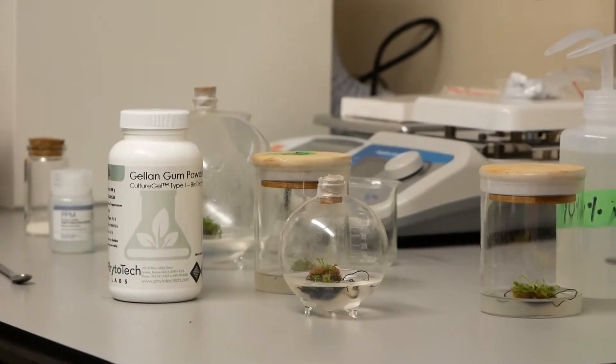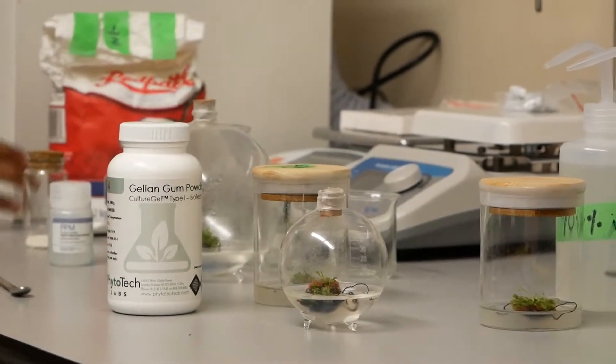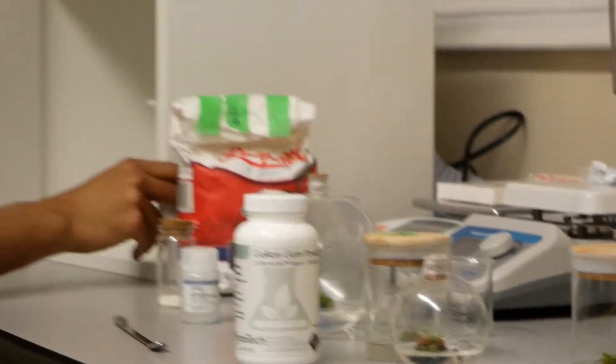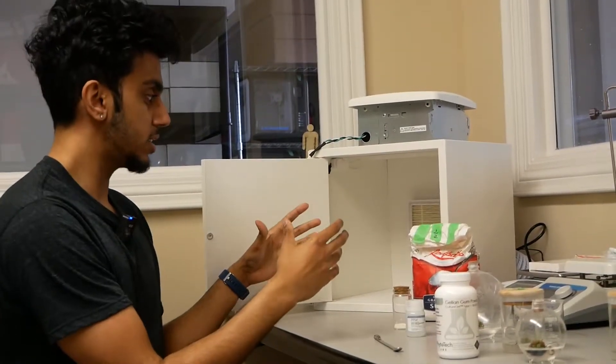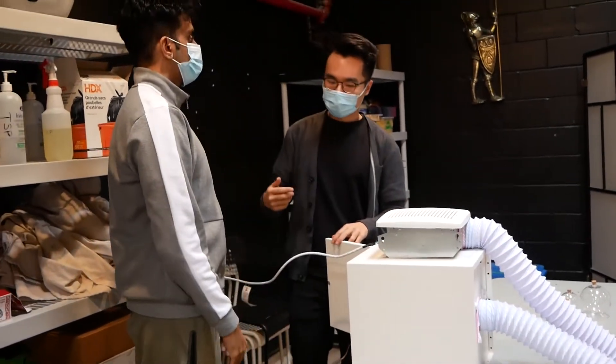We took the plant material and inside this laminar flow hood, we were able to, in a sterilized space, transfer the plant material into each of these vessels.